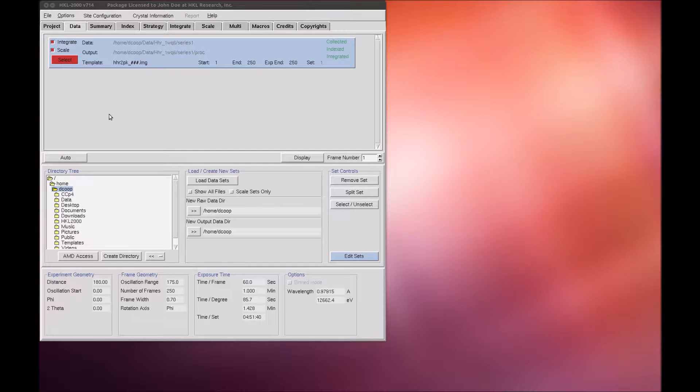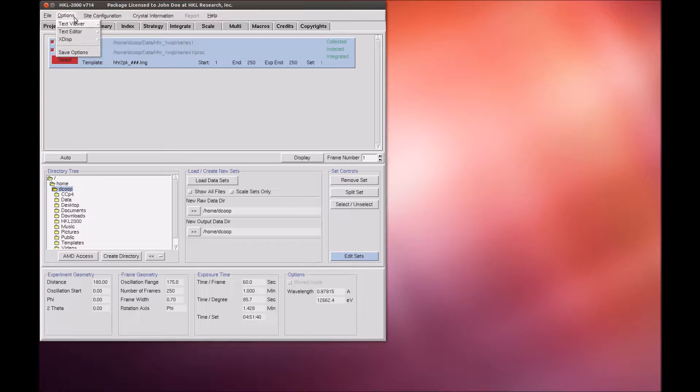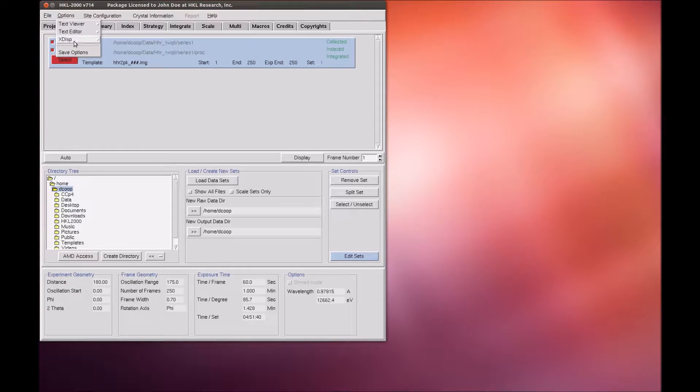This new version may not be the default version in your setup. To work with the new version, in the main menu, select Options, XDISP, XDISP-QT.